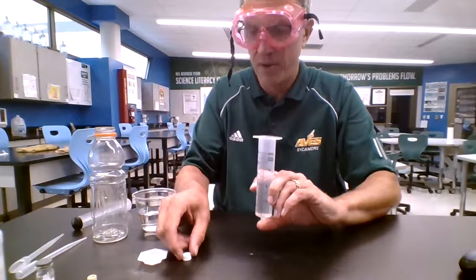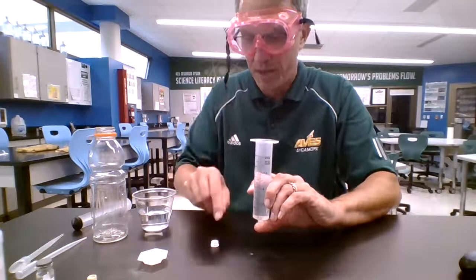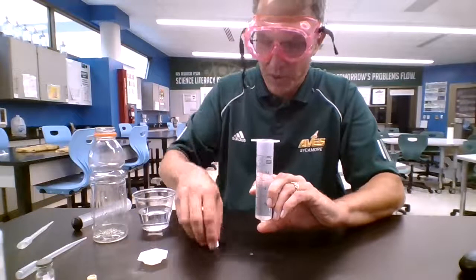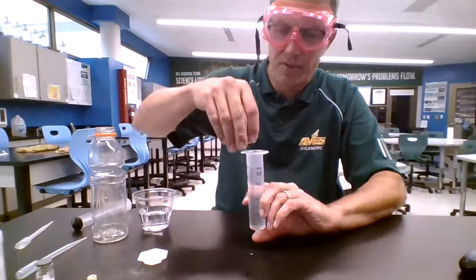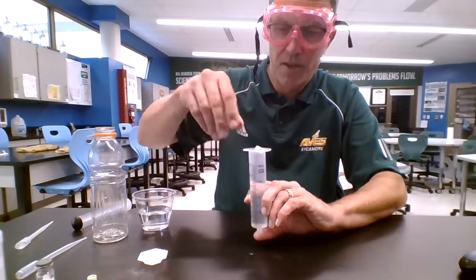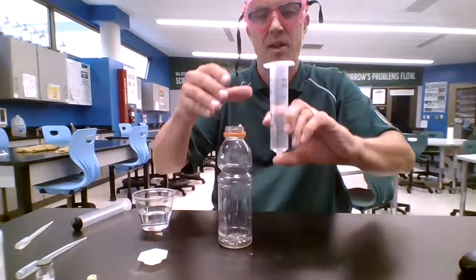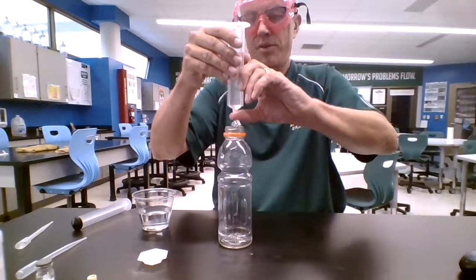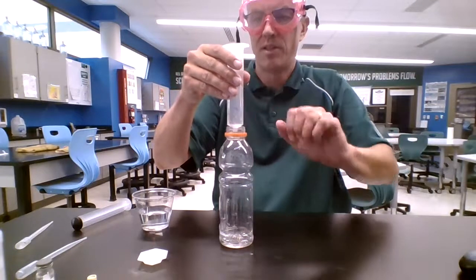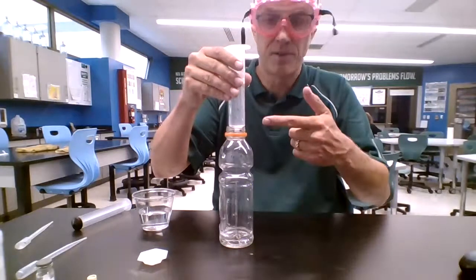Next thing I want to do is to very carefully take my little cap here. Now, this cap was filled by my lab partner or by me with baking soda using my little spatula. So what I'm going to do now is to take this and put it right here as a boat, and hopefully it won't get wet. So there you go. So it's floating, and you want to take this and then put it over our little bottle. Now, with the water going, and without getting wet, this goes all the way down, and this is a way that we can deliver the reagent into the cylinder without getting it wet.